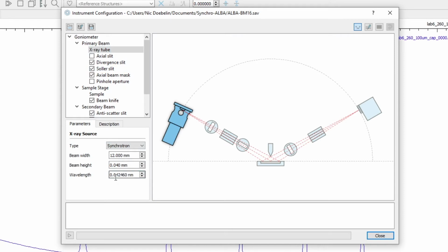With the X-ray tube, we specify synchrotron radiation, and the value was provided by the user. This is the wavelength that was used in nanometers. And now we will create a very small target. I don't know the diameter of the beam, but maybe let's assume when it leaves the collimator it's 0.3 millimeters in diameter. So that's just a guess. Let's try that. Then we don't have this slit.